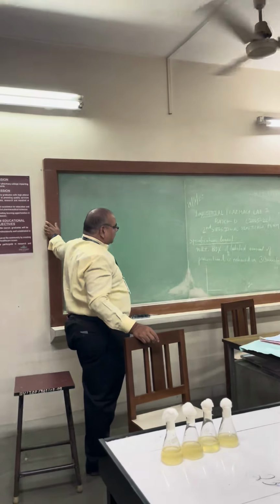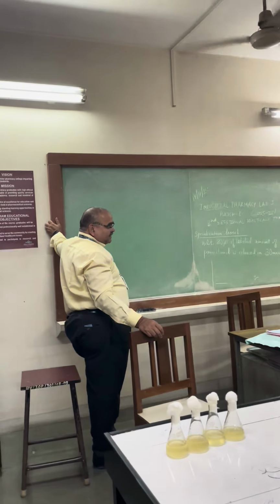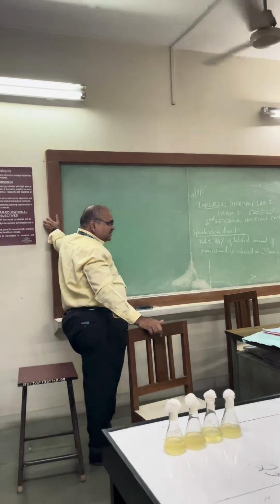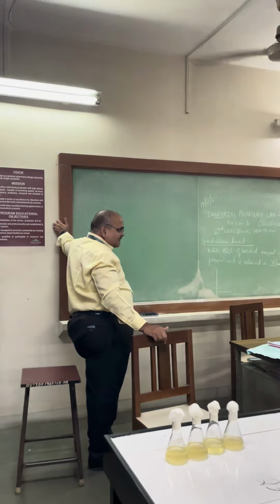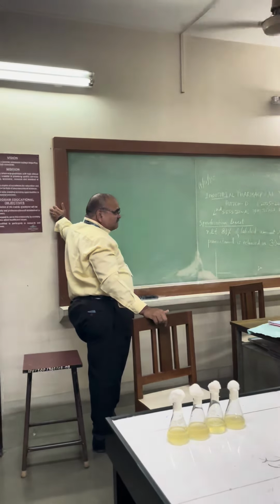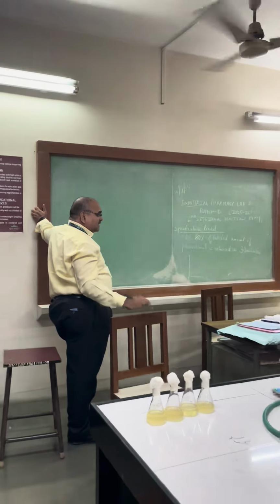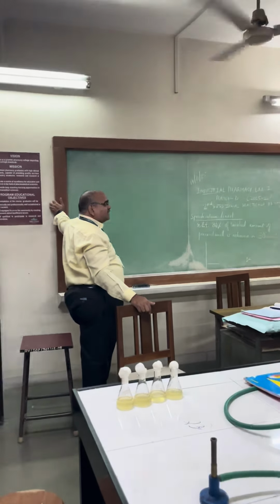Now I will try to explain to you the principle of this amylase test, and then I will tell you the procedure for amylase test. Just pay attention. In second year, semester 3, under pharmaceutical microbiology, these biochemical tests are included. What is the objective of these biochemical tests?